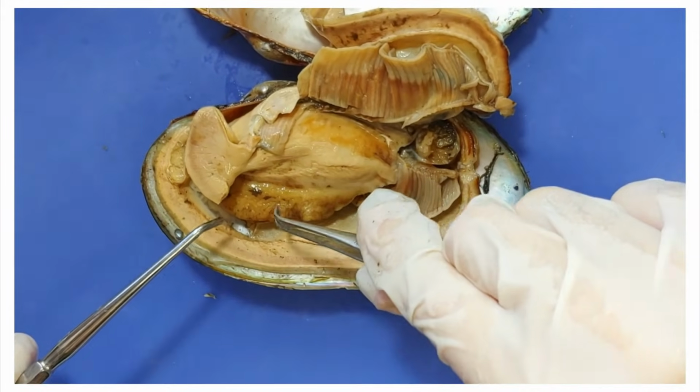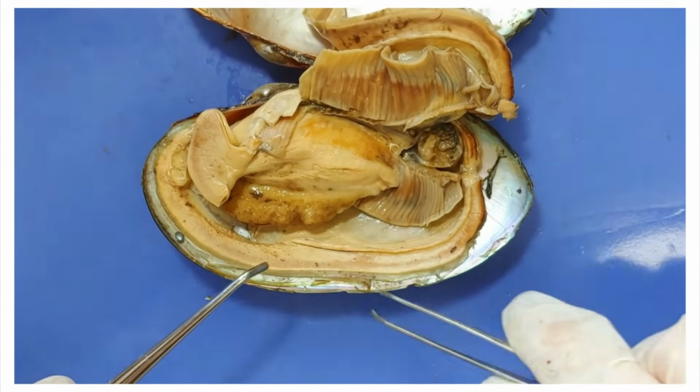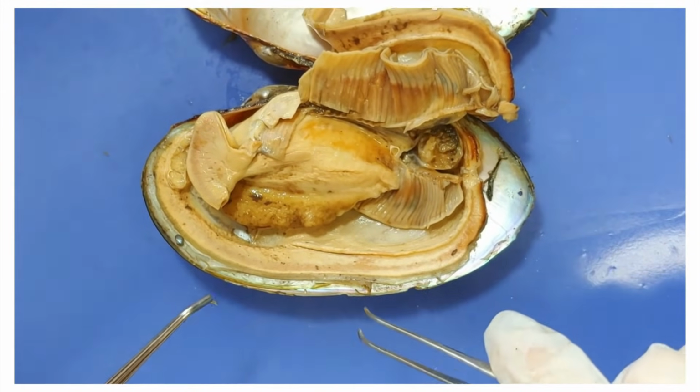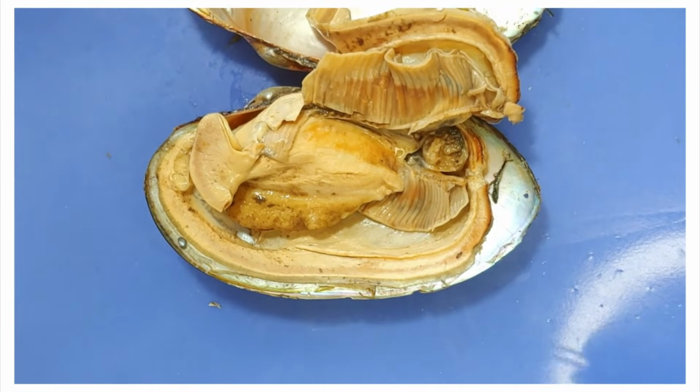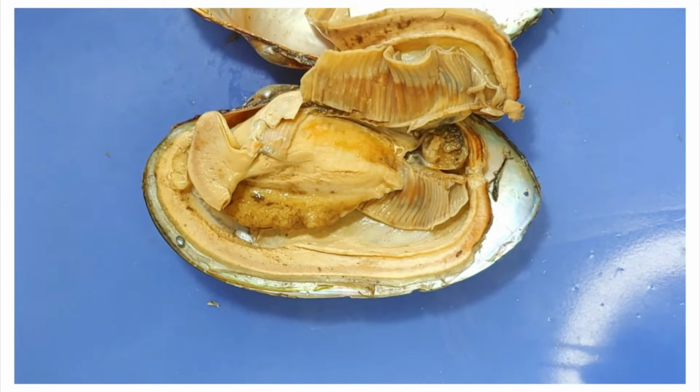Right here, the foot is a muscular structure that helps the clam move around and to burrow into the sand. Now you know that clams travel by foot. No, I'm not apologizing for that joke either. You knew what you were in for after that first one.